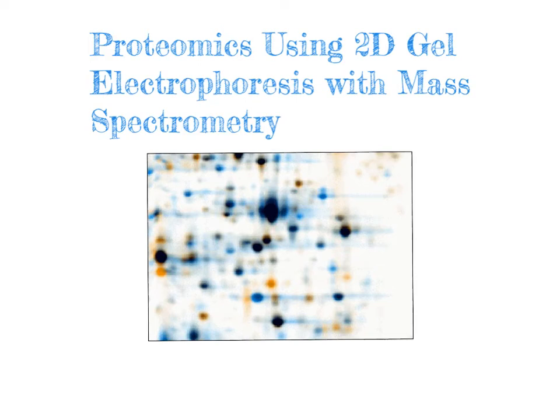In the last few videos, we looked at metabolomics methods, strategies for evaluating collections of small molecules from different types of samples, such as treatments of diseased samples versus controls, samples that were not diseased. Here, what we're going to do is extend this coverage of omics to include proteomics, the evaluation of not just one protein from a particular organism or cell, but instead a collection of multiple proteins.